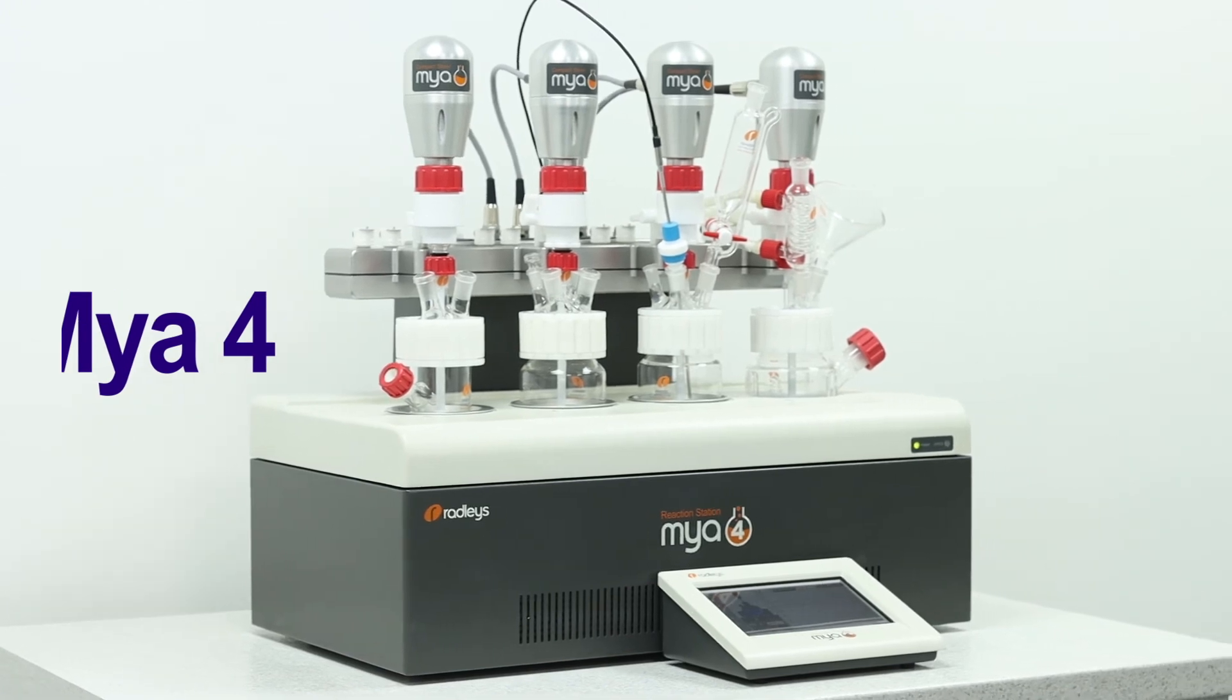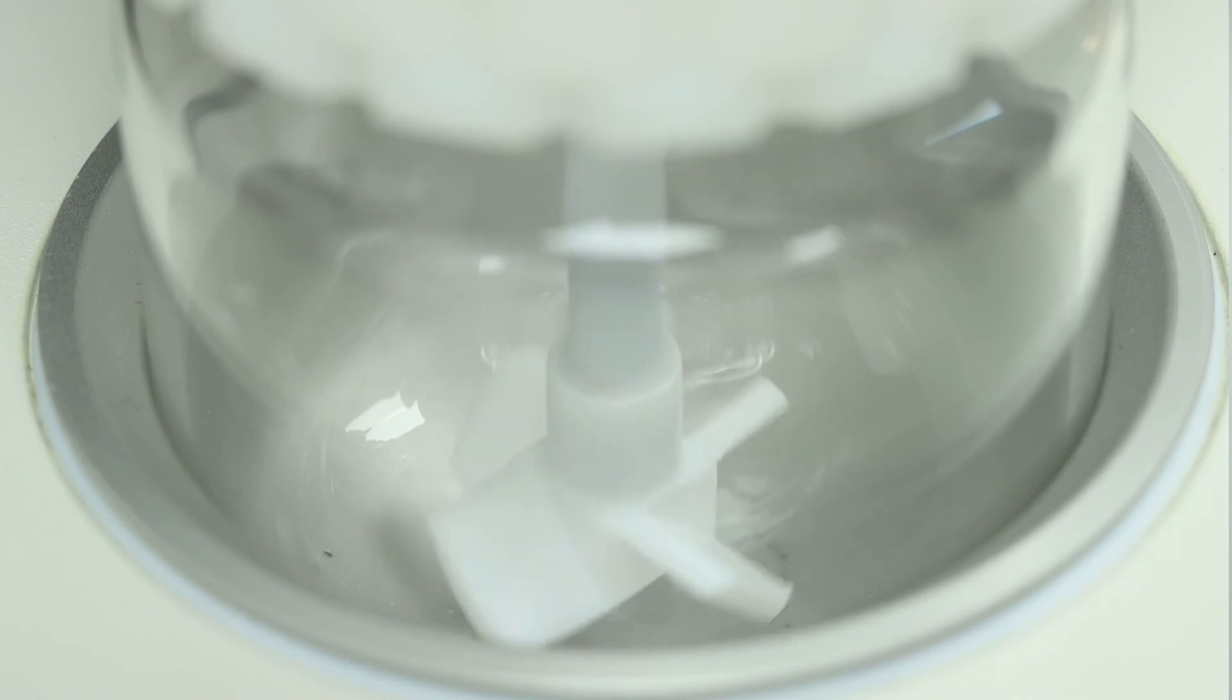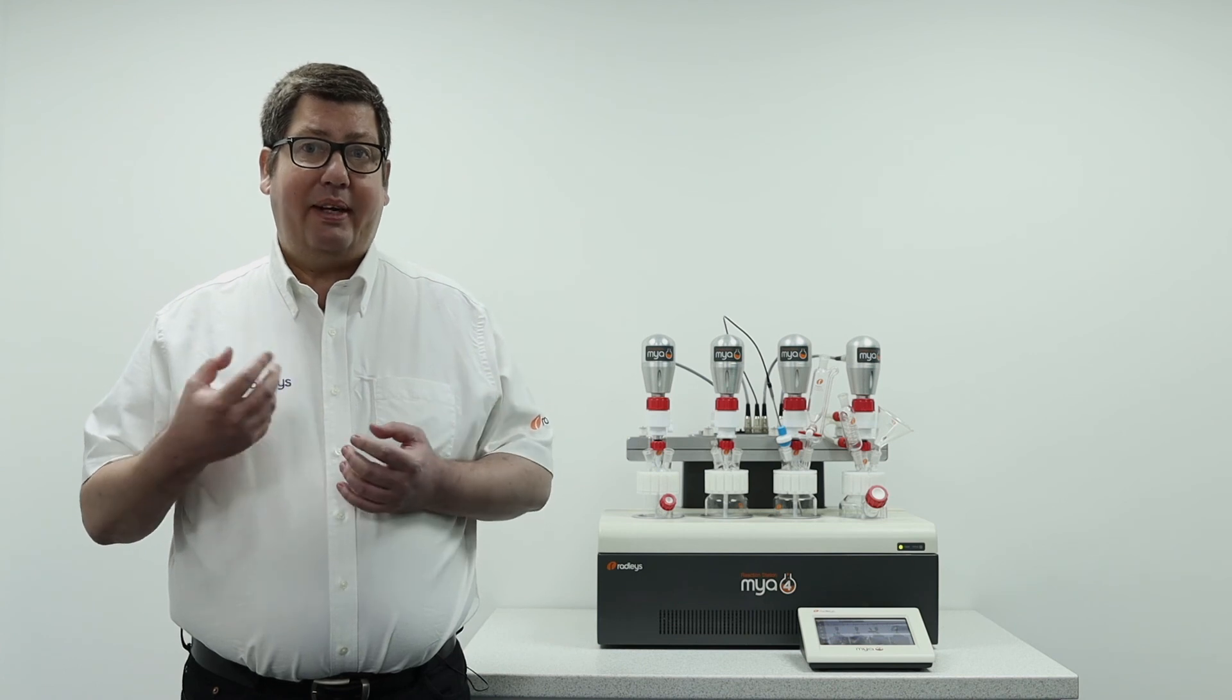Apparatus such as the Mya 4 reaction station allows the chemist to work in parallel with active heating and cooling with sample volumes of 200 ml or less and independently controlled overhead stirring. The development lab can therefore closely mimic what is happening in a manufacturing process.